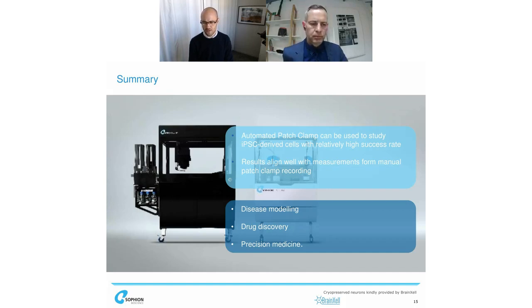I think we could also zero in on what kind of series resistance the group has had. And I think for these studies, we've really included only the ones that had a low series resistance, which certainly also helps to get a clean readout.